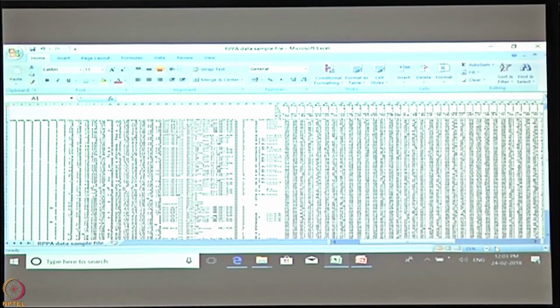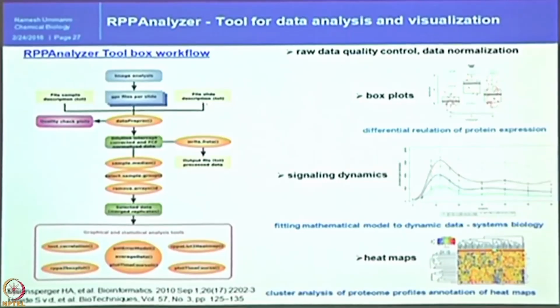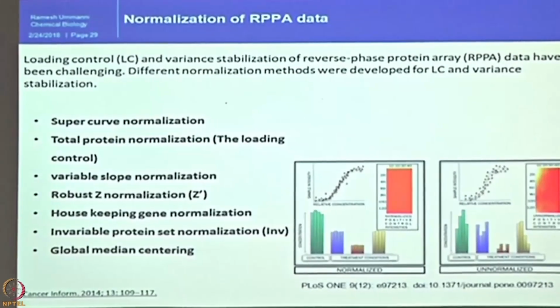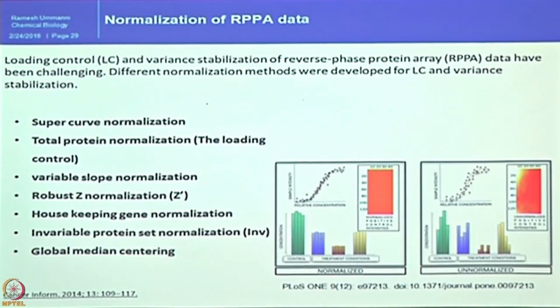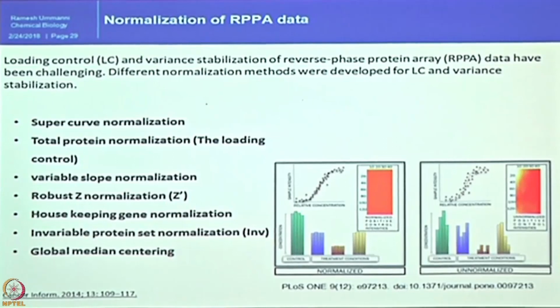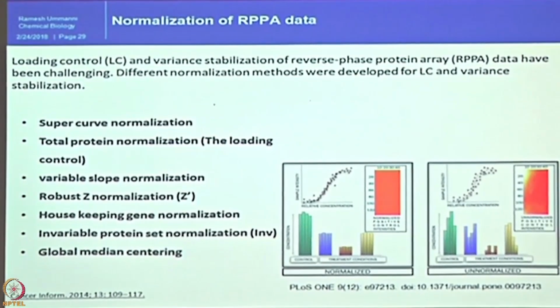From this, if you load this data into commercially available software, as per the pre-designed analysis part you will get the data output, but you cannot manage to get the information you want from your samples according to your experimental requirements. When you have such a high-end data set, you need to worry about how correct the experiment is. One of the sensitive points Dr. Sanjeeva touched on in the morning very nicely, and gently suggested you follow, is normalization methods, particularly in RPPA data.